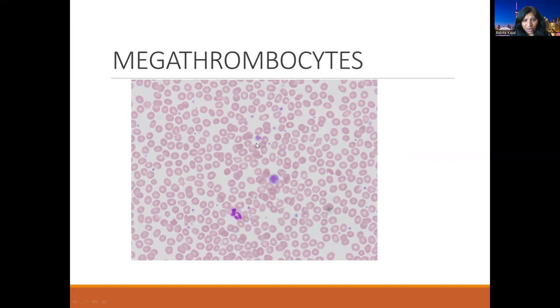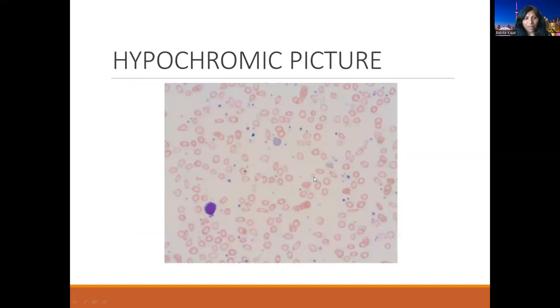Very rarely, we can see these large platelets. Here you can see the size of this platelet is almost the size of an RBC, or even bigger. This is a megathrombocyte.